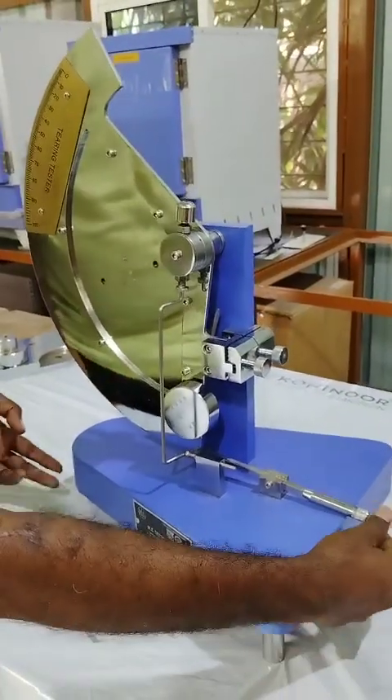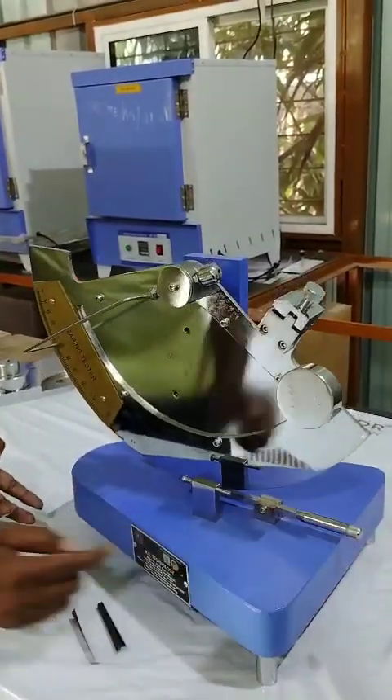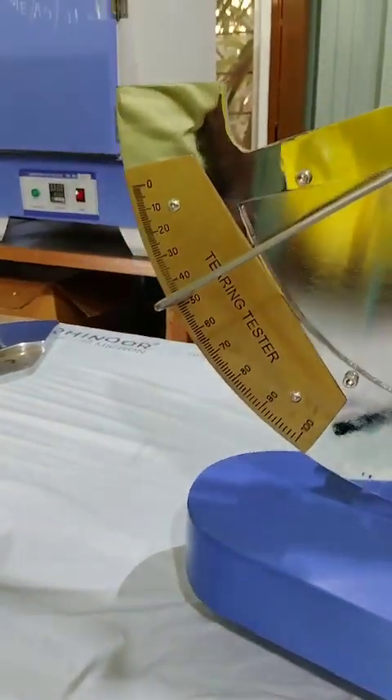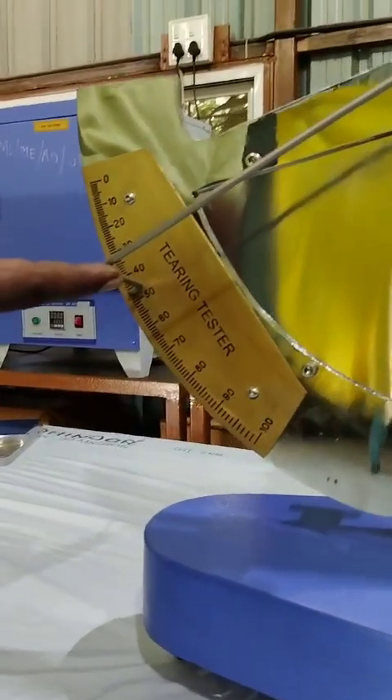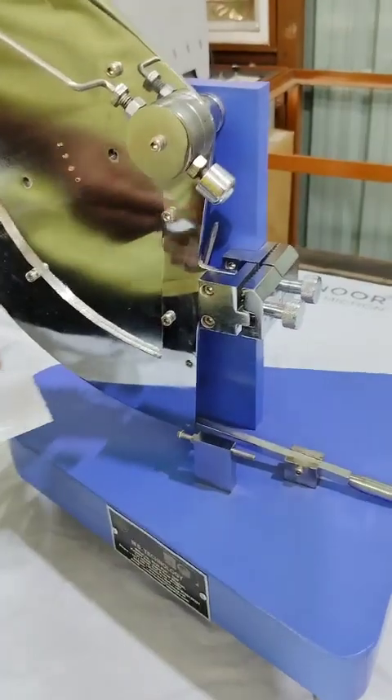Now, release the pendulum and observe the reading. It is at 45 — the reading is 45. Note down the reading.